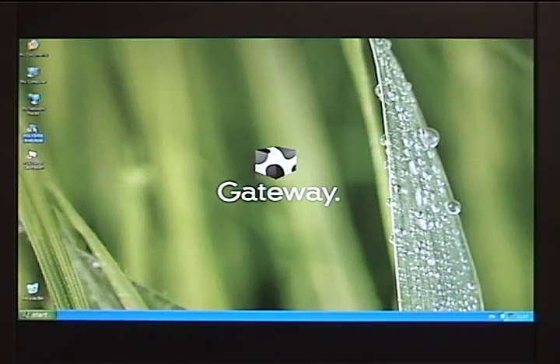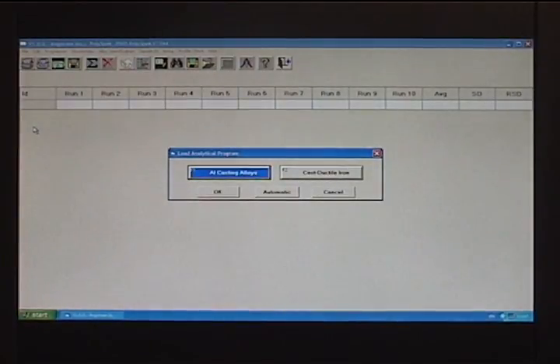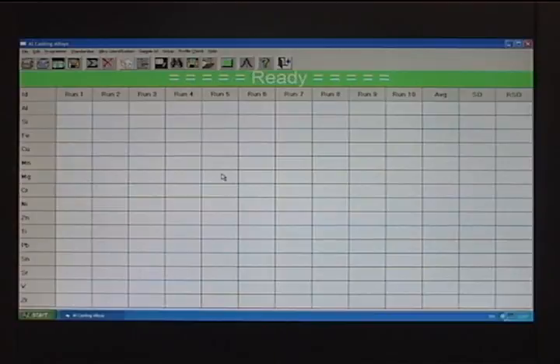The hardware is controlled by the PolySpec analytical software, which is activated with a self-installed shortcut on the desktop. When double clicked, the program launches and prompts the operator to select a program to run. Once a program is selected, the software goes to the ready state, indicating it is ready to run a sample.